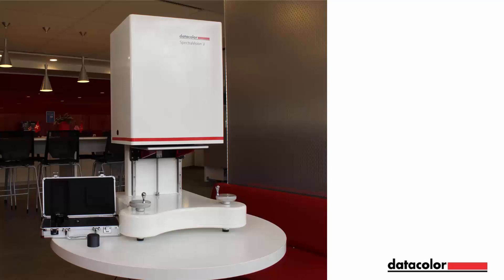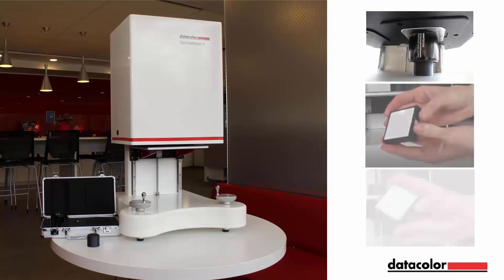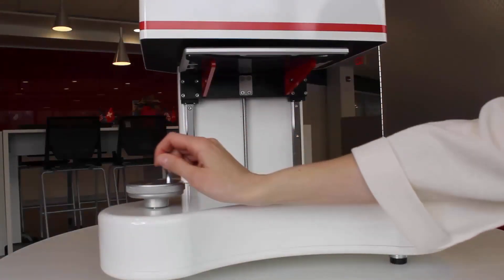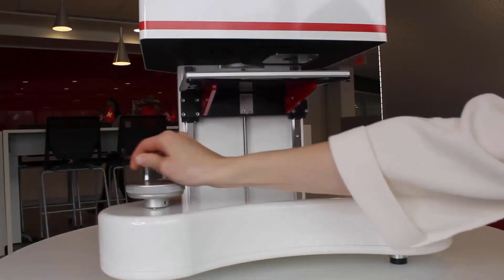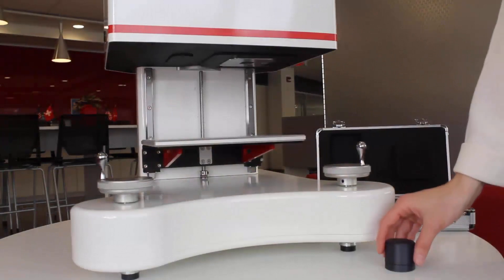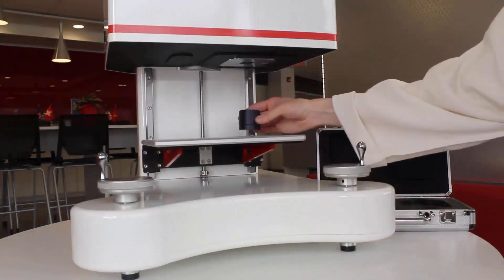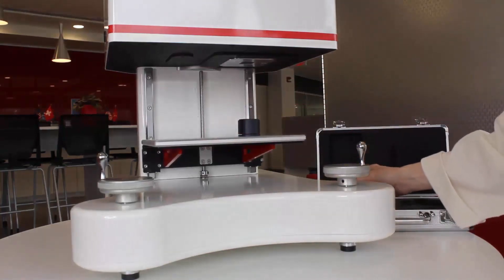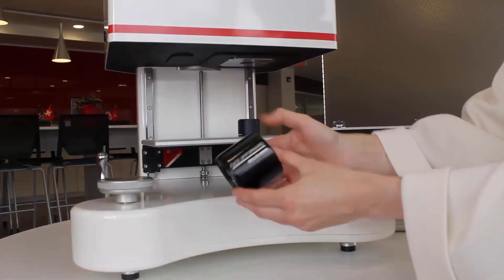We will begin by calibrating the instrument using the calibration kit, which contains the black trap, white and green calibration tiles. To start the process, lower the sample tray by rotating the coarse dial to place the calibration stand in the inset of the sample tray. Place the black trap on the stand so that the text faces forward.